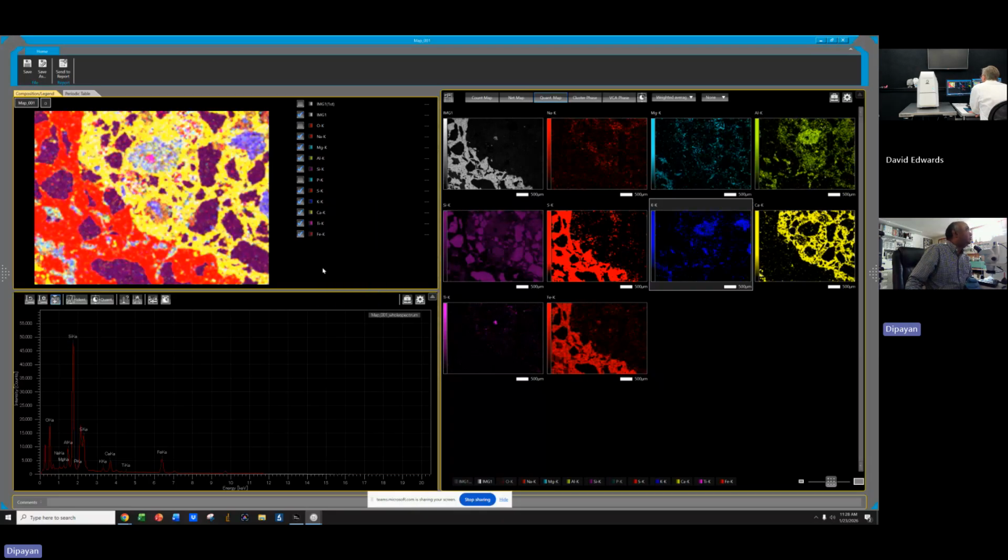and maybe choose blue. Something where it really stands up, or maybe black. I don't know. I mean, see, this is where I get really stuck. I'm not an artist, and that's why I get really stuck. So this is like if you have some art sense to get the best composition back. Yeah, and the reason it is getting difficult is because it's physically picking up every element's color instead of emphasizing, instead of cheating and throwing out all the others and highlighting the main ones.